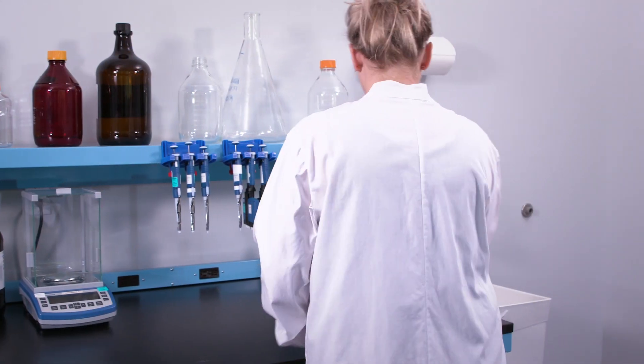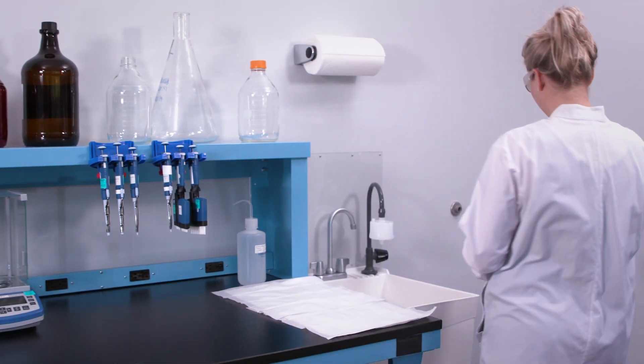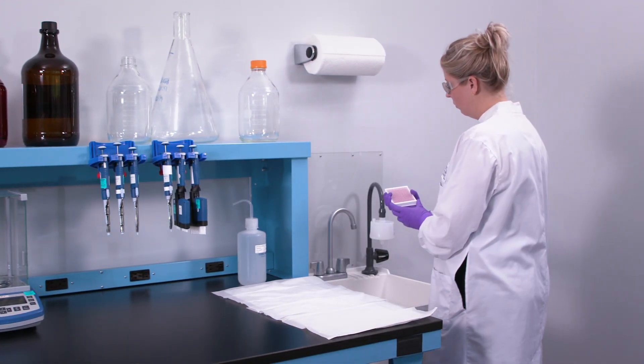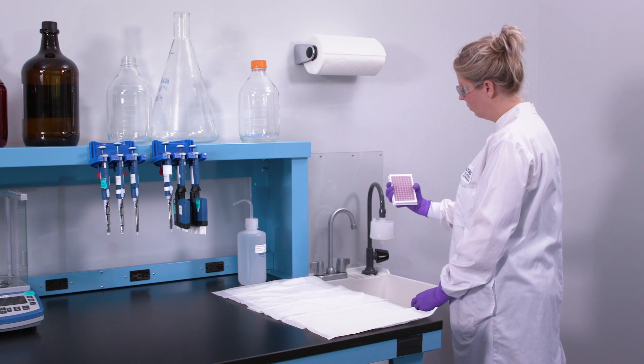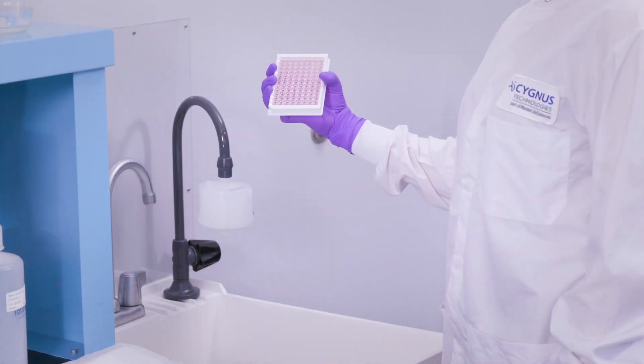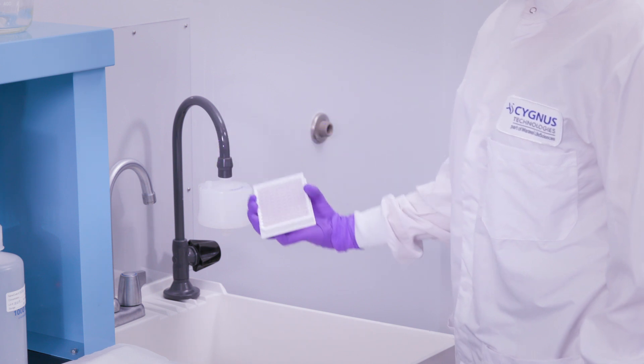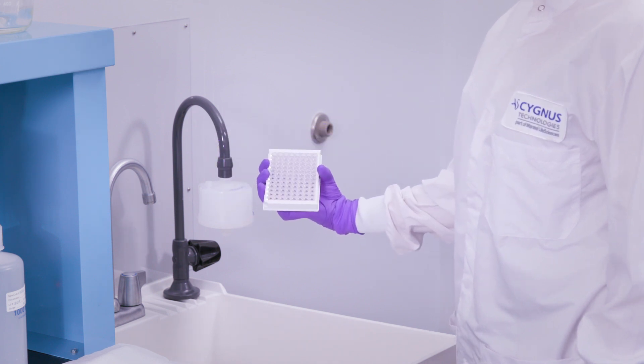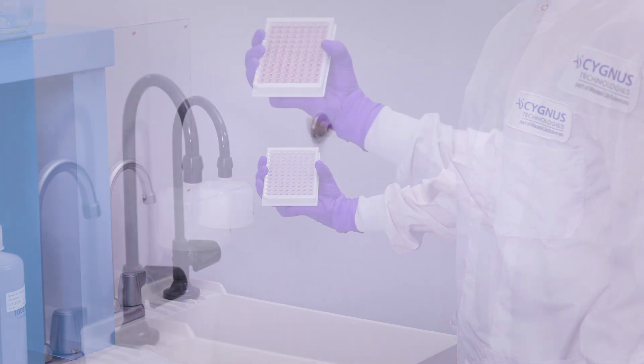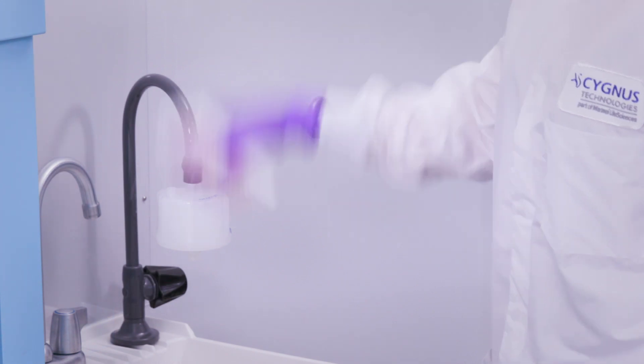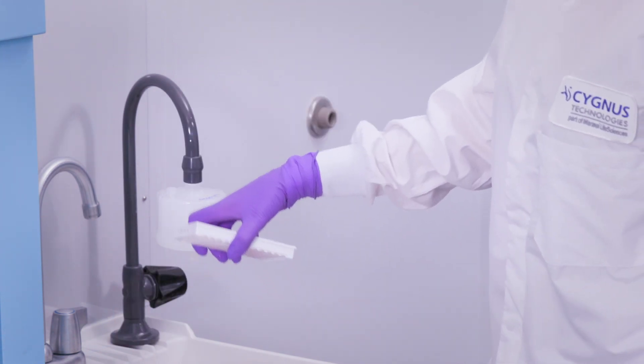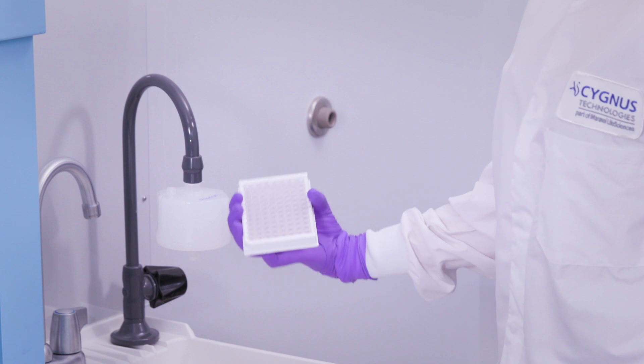Next, hold the plate over the sink and then turn the plate upside down while rapidly accelerating your arm and hand downward in one single motion. Then abruptly stop your arm. This will force the liquid from the strips into the sink. When done properly, you should not get any liquid on your fingers or on the outside of the strip wells and plate holder.